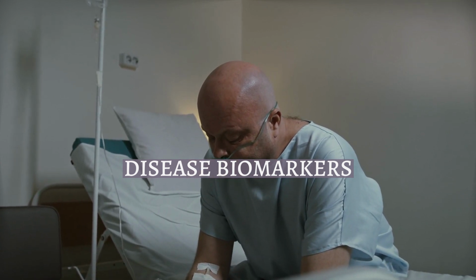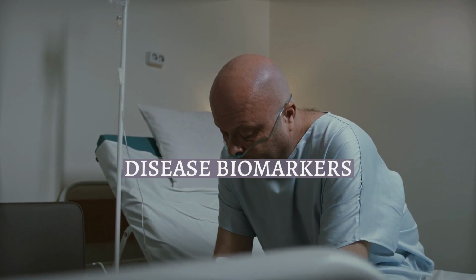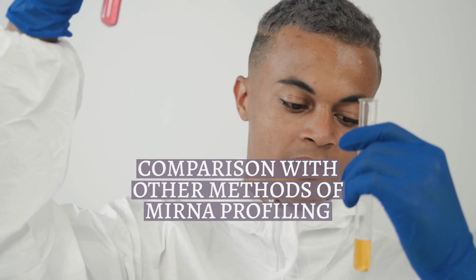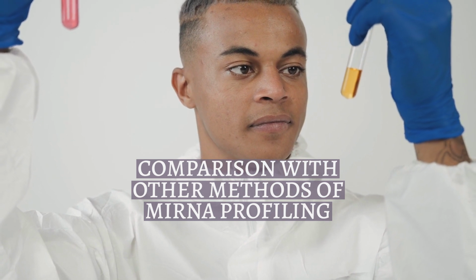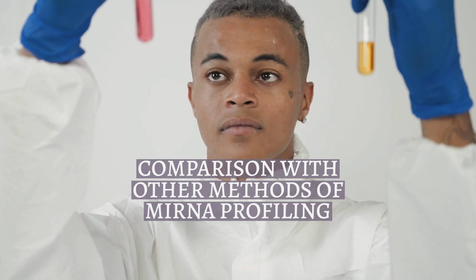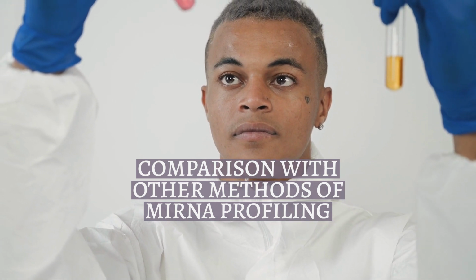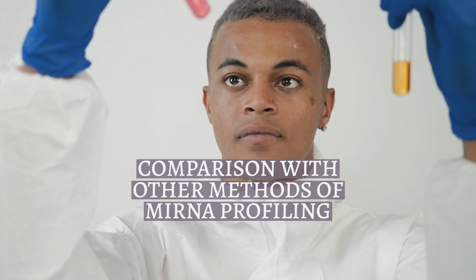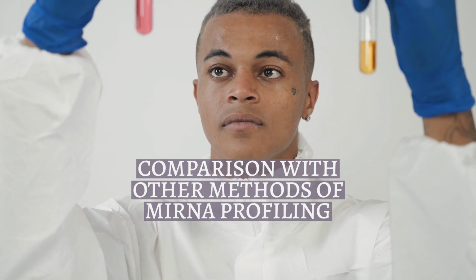Table 1, cancer subtypes distinguished by microRNAs. This is not a comprehensive list of miRNAs involved with these malignancies. Let's now turn our attention to comparison with other methods of miRNA profiling. The disadvantages of using miRNA-seq over other methods of miRNA profiling are that it is more expensive, generally requires a larger amount of total RNA, involves extensive amplification, and is more time-consuming than microarray and qPCR methods.